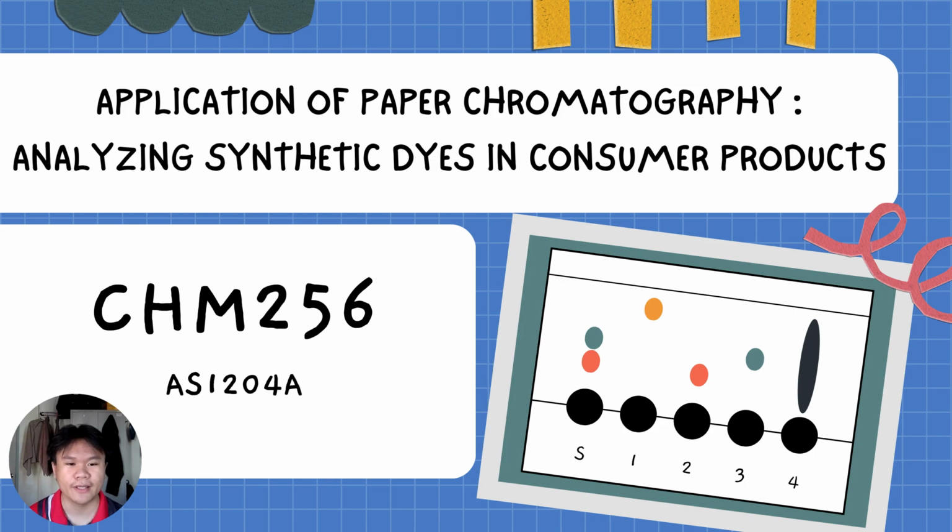Today, our group will be exploring a real-world application of basic analytical chemistry that affects us every single day. We will be discussing the use of paper chromatography to analyze and separate synthetic food dyes in everyday consumer products.